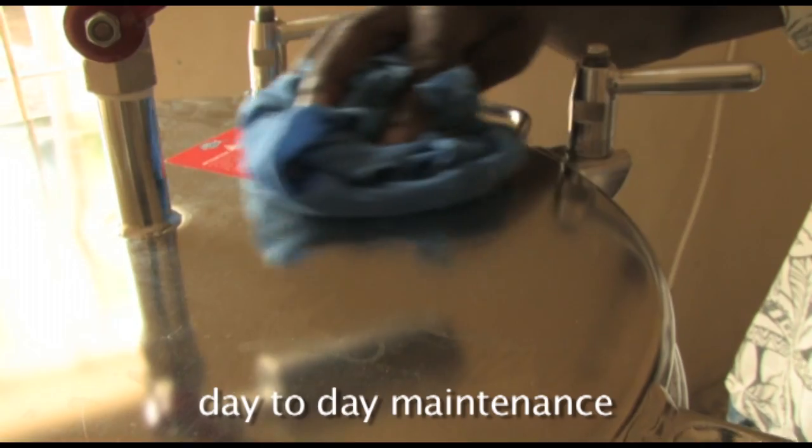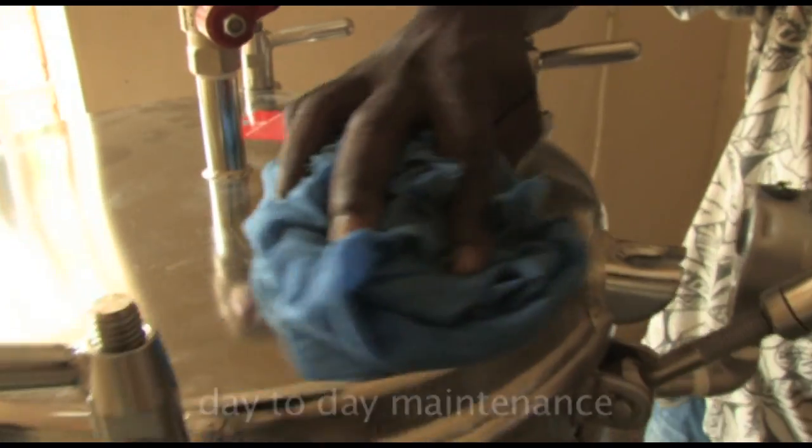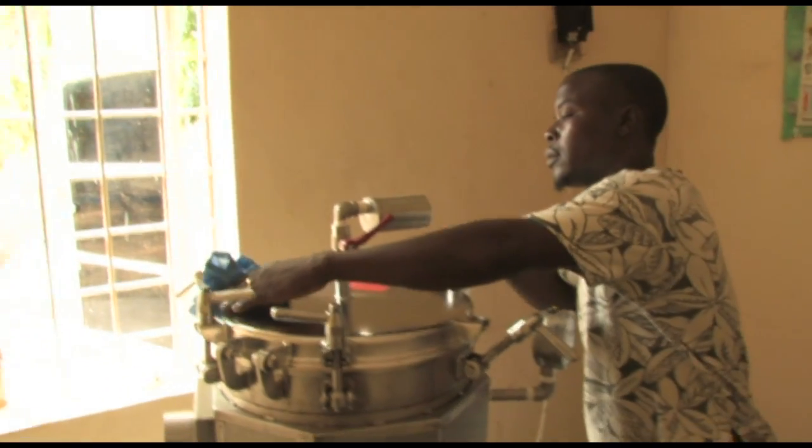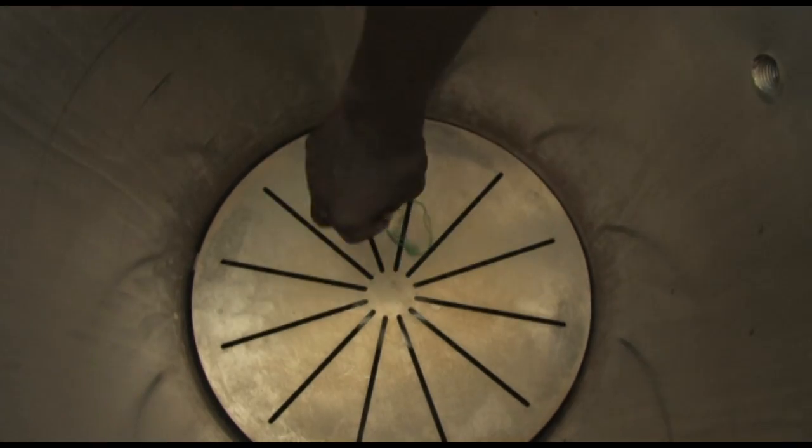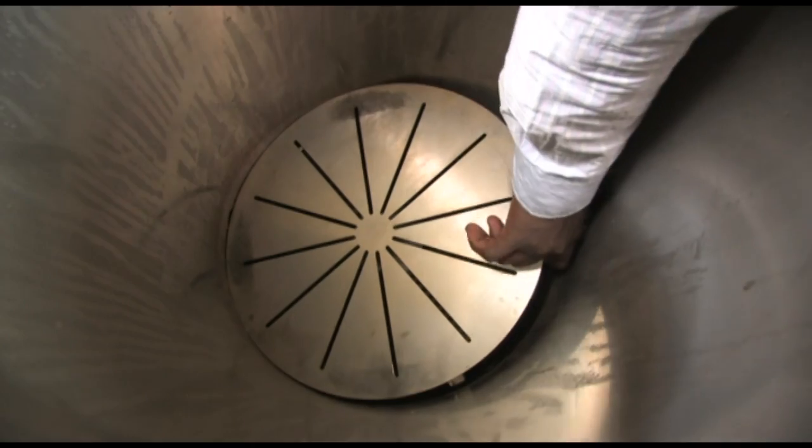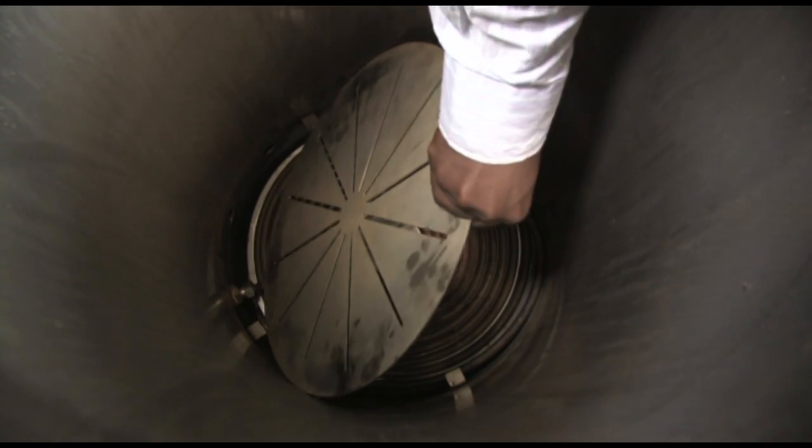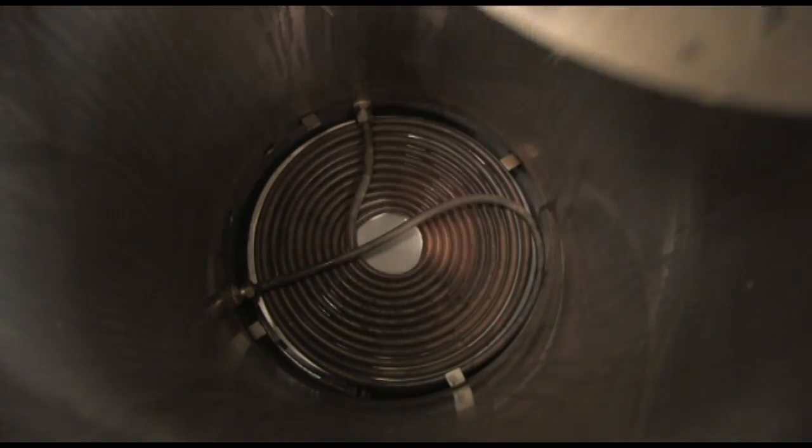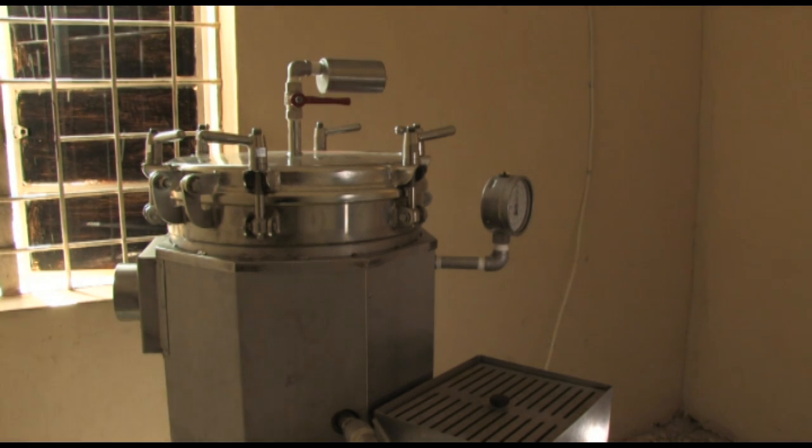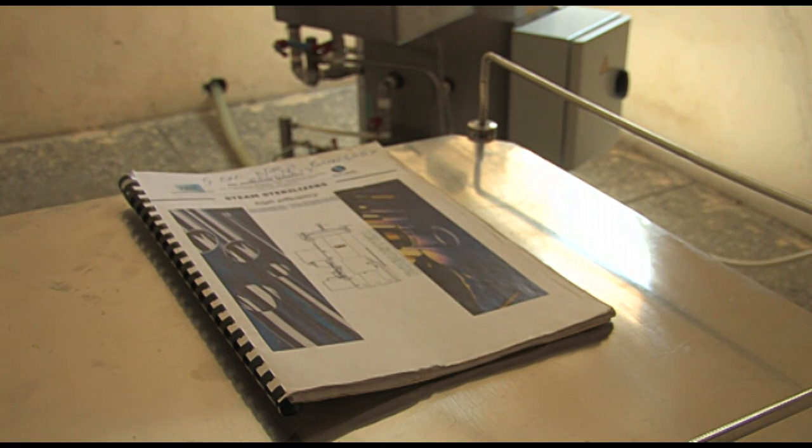Autoclaves must be regularly maintained. General cleaning should be done with a clean, dry cloth. Do this at the end of the working day. Ensure that the bottom is free from any textile fluff. To check this, remove the bottom plate in the sterilizing chamber. The seal on the lid must be checked for damages. Read the instruction manual for information on day-to-day maintenance.